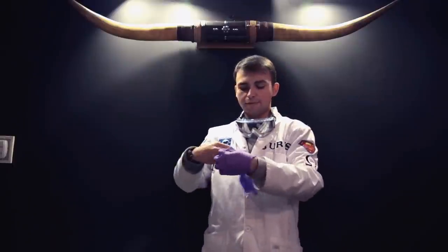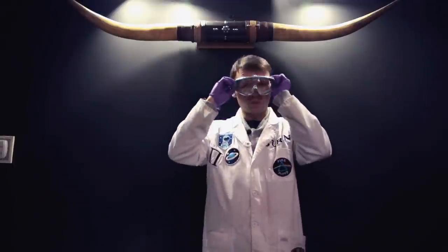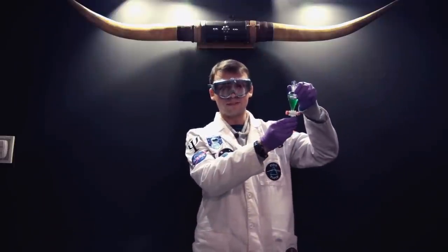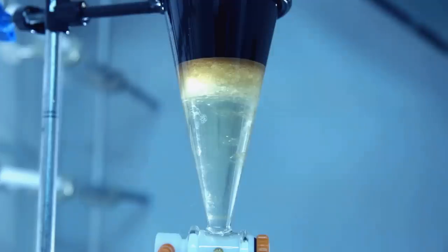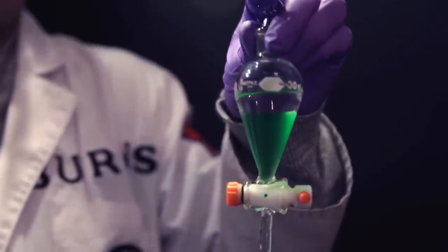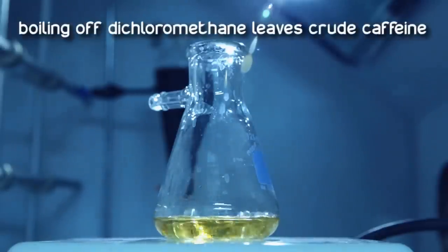To extract the caffeine out of our coffee, we performed something known as a liquid-liquid extraction. We used a solvent known as dichloromethane, and we put it in something known as a separatory funnel. Caffeine is much more soluble in dichloromethane than it is in water. So the caffeine will leave the water and join the dichloromethane layer, which can be very easily extracted with the separatory funnel by turning this stopcock. And that will collect the caffeine and dichloromethane for evaporation.